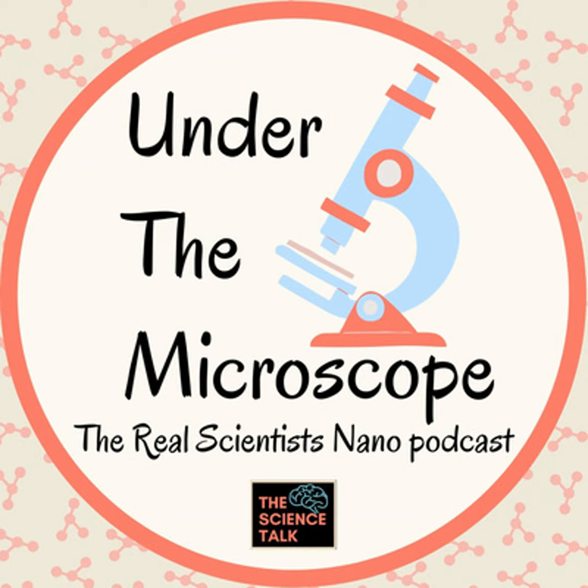So let's start with understanding your research a bit. Could you explain your research to us in super simple words, please? I've been working my whole career with atomic force microscopes. So my research basically deals with the AFM, atomic force microscope, usually called AFM from the capital letters.